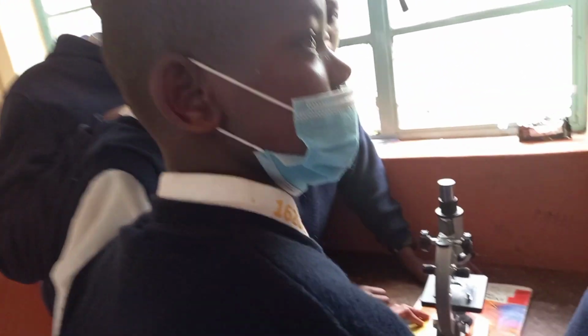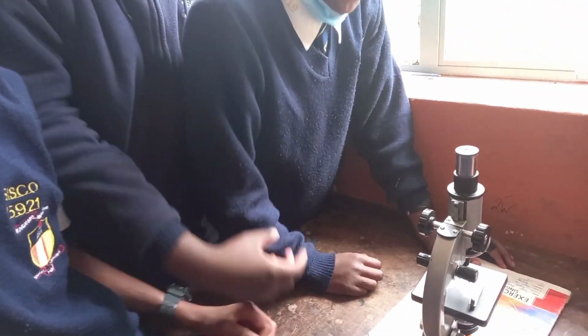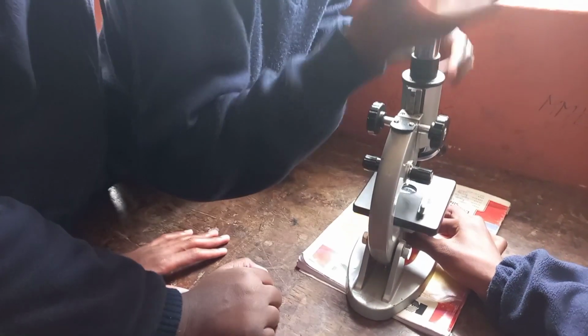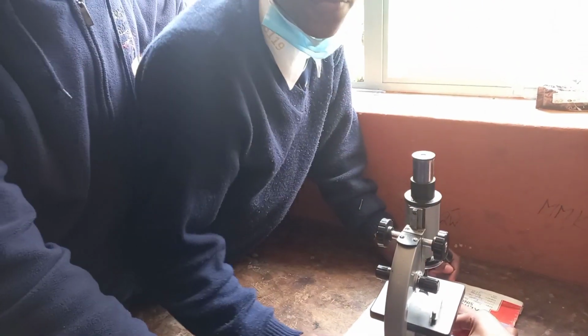Now demonstrate how you have done it. You look through there and adjust the mirror. You have to learn how to do it yourself because you're the one who is observing. I see light. Do you see light? What is the shape of the light? Circular.